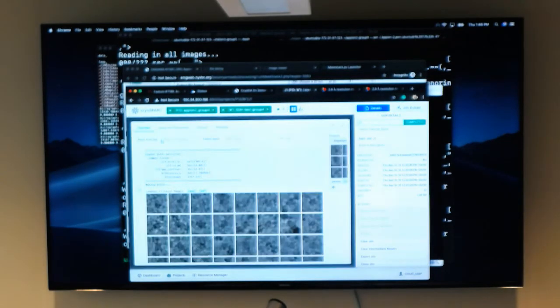They started off with importing micrographs. You can actually determine the CTF parameters. You can see the high tension, and the Cs. So this must have been collected on a Cs corrected system. For Krios, typically our Cs is 2.7 millimeters. When we're collecting on an image corrected system, we use some nominal Cs like 0.001. So I assume this was collected on Krios 2 in this facility.